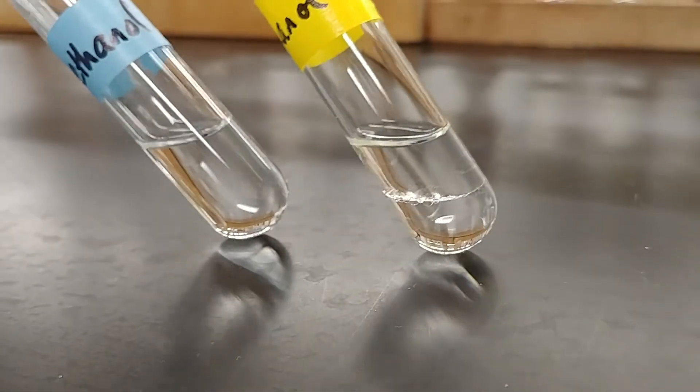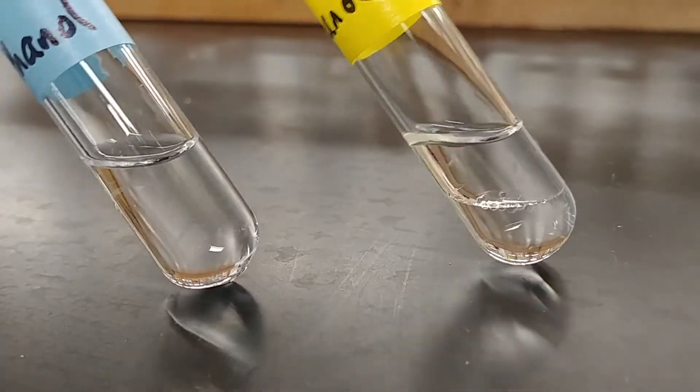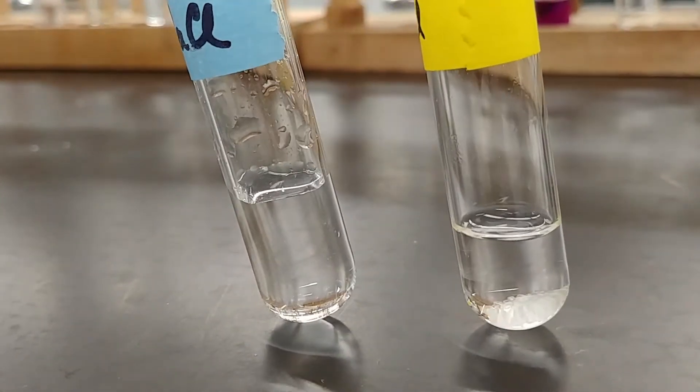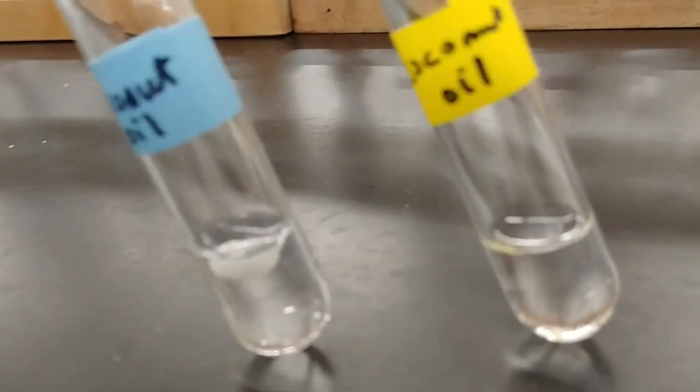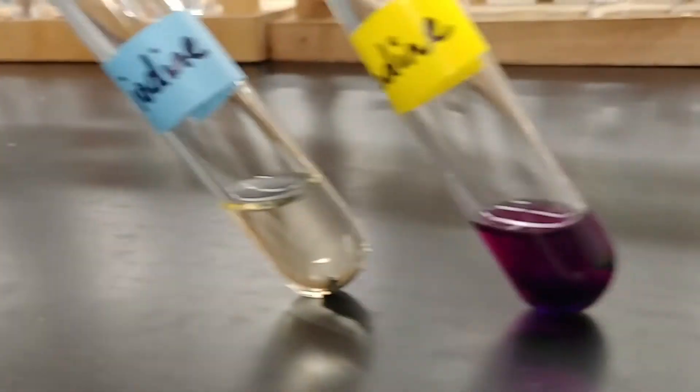So again, comparing the ethanol and the cyclohexane in the two different solvents. The yellow tape is the cyclohexane. The blue tape is the water. And then to go through our solids again, the sodium chloride, the coconut oil, the iodine. We already saw the ethanol. And then finally, we have the sugar.